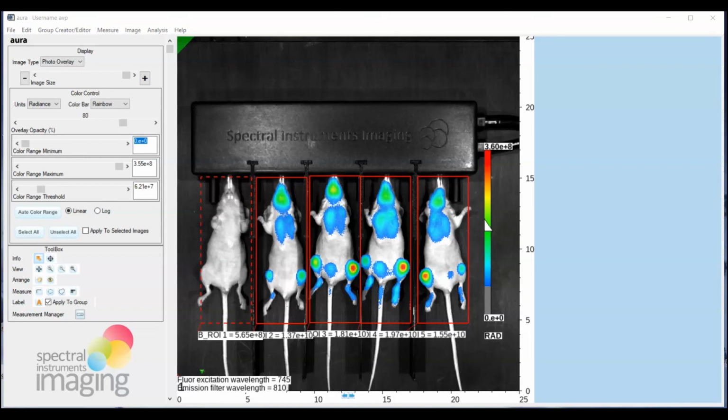What we are going to do here is optimize the presentation of the calibration bar in your images. Now, what you can see is that right now, by default, the calibration bar captures the max and will go to 0 as a default minimum, when in fact the threshold data that's presented in your image is above 0. So we're simply going to take the threshold value and apply it to the minimum of the calibration bar. So the entire range of the calibration bar is nicely used in defining the presented data.